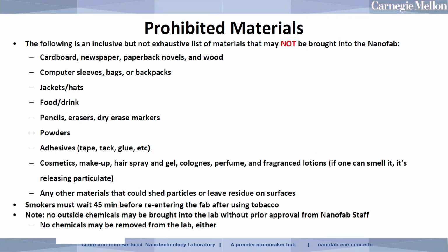So we have a list here of materials that are prohibited in the lab. And most of these are due to particle concerns. So this is not necessarily an exhaustive list of materials, but we'll just start at the top. So you never want to bring in any type of paper product into the clean room, anything like cardboard or newspaper or books or wood or anything like that. Wood and paper products shed a lot of particles, so we want to avoid bringing them in.